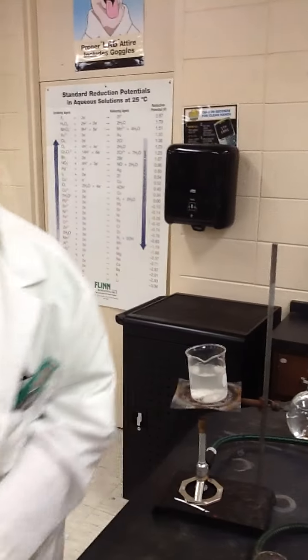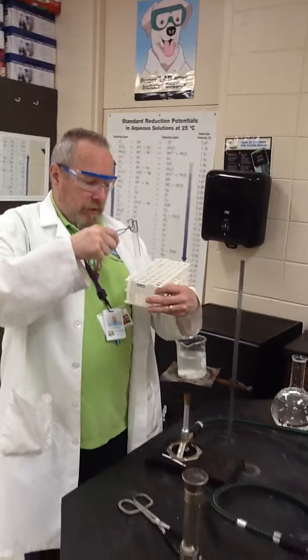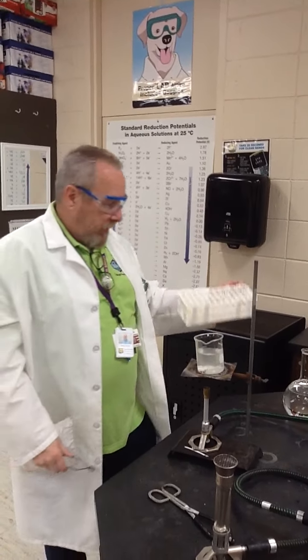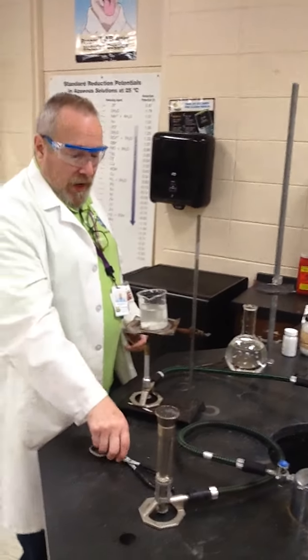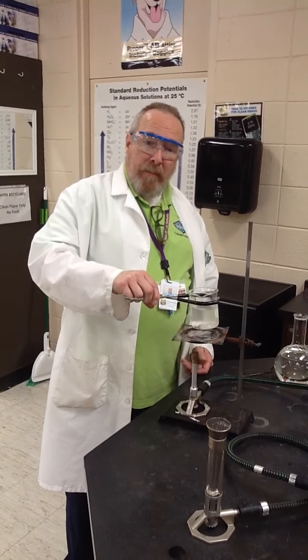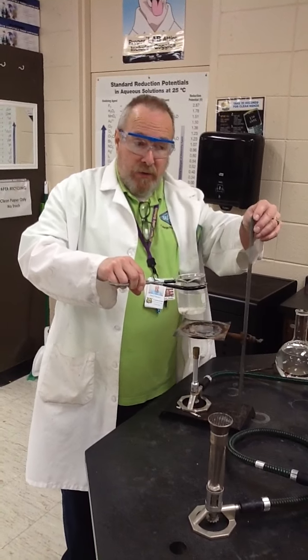At this point, I would put it into my test tube rack here. Set it aside for observation. That's exactly what we're going to do, is observe and see if we still have a precipitate, a solid that is formed in there. And then, this is still hot. Maybe I want to take this down so that it's unlikely to get knocked over or tip over.